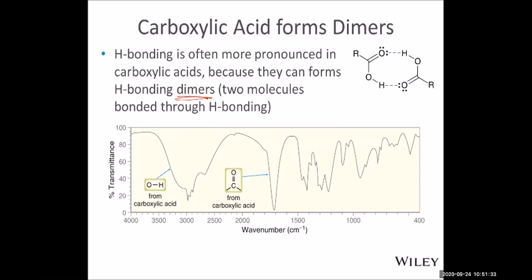Unlike NMR, which we will learn next semester, infrared is not very precise about the molecular formulas. For example, how many hydrogen, how many carbon, infrared cannot tell. But infrared can often be used to tell the absence or presence of a certain functional group. And especially when you have two compounds where we know what functional group is in each molecule, then we just compare the infrared and find out if the molecules are present.